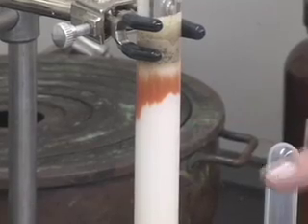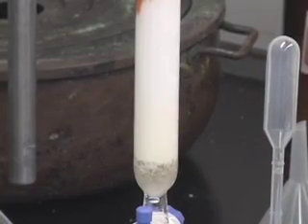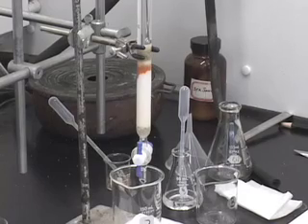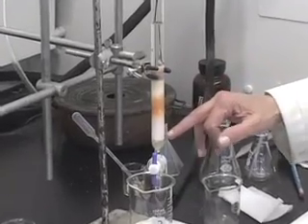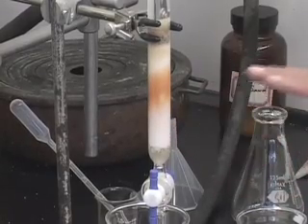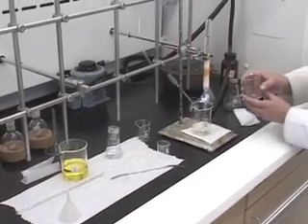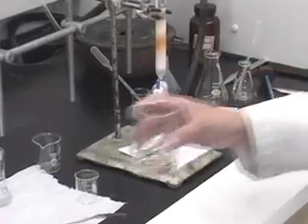When the orange band is about a centimeter and a half above the sand level, you want to change the fraction-collecting beaker to the one labeled 3. Notice that the orange band is getting closer to the sand — it is about a centimeter and a half to two centimeters above the sand level. There was a clear white layer in between, which told me there was a good separation between the yellow fraction and the orange fraction. So I am going to change the beaker to beaker number 3, for our last fraction.